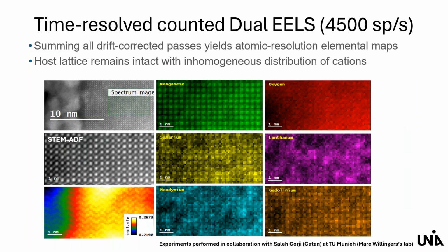I think in general you did talk about this. It probably goes back to what you explained: because of the mixture of elements and the very thin sample that we have, we do not see all the elements in the map, and some of them are missing, which you nicely explained. Yeah, I think that's the main reason there.